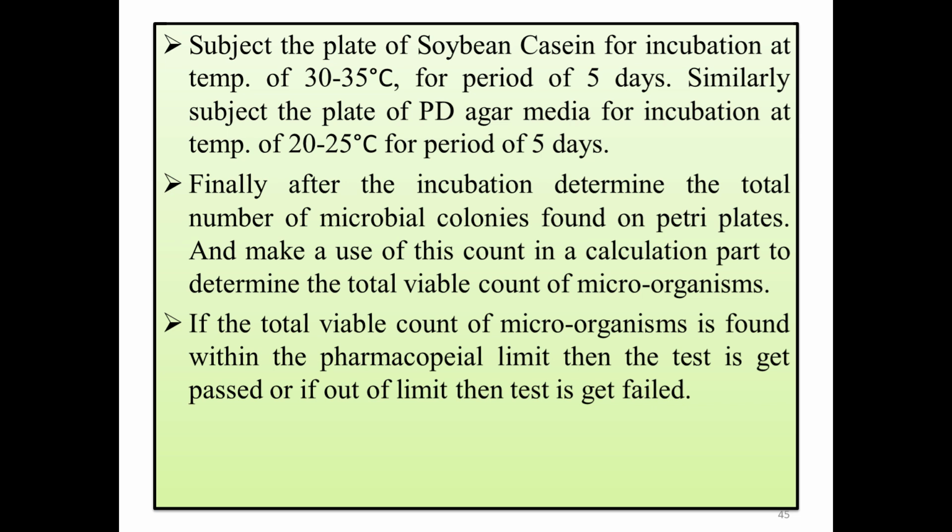Okay, and then the second petri plate, which contains PD agar media, is incubated at 20 to 25 degrees Celsius for 5 days. Both plates are incubated for 5 days, but both have different temperature conditions.